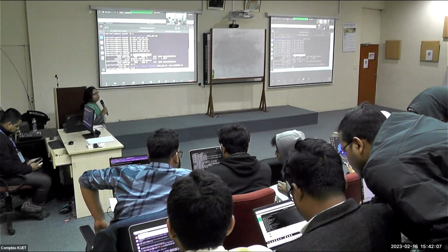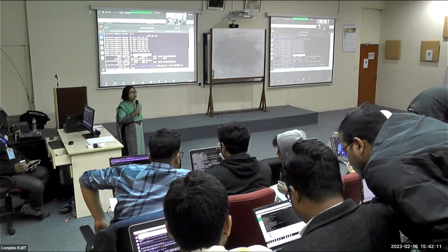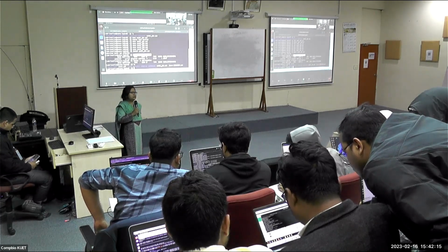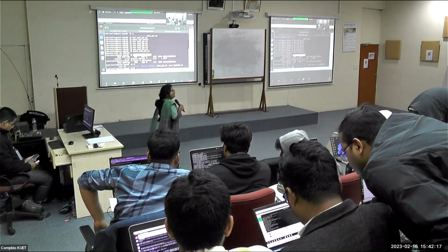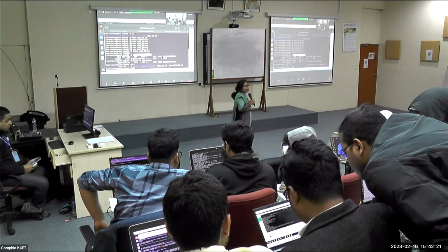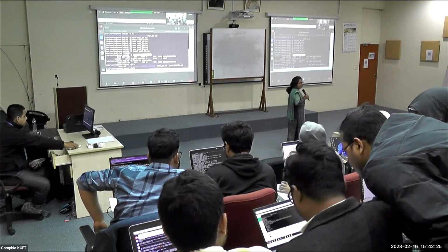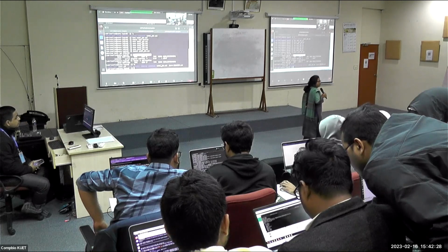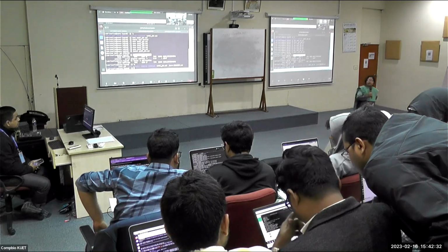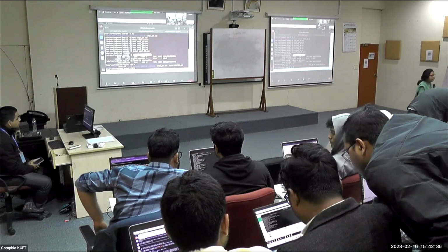How many of you could generate the E. coli.sam file? Only one? 2, 3? How many of you could generate the .sam file? If it is not generated yet, then there must be some problem in the command that you wrote. Try entering the nano submit file again.